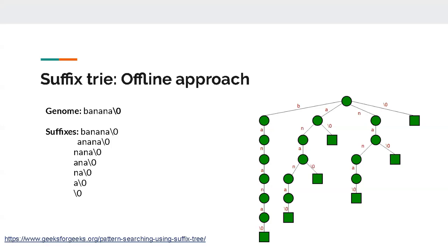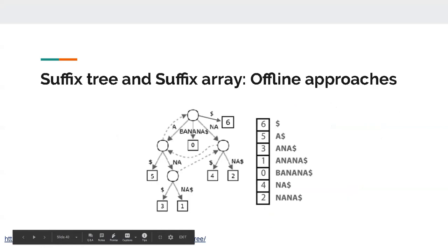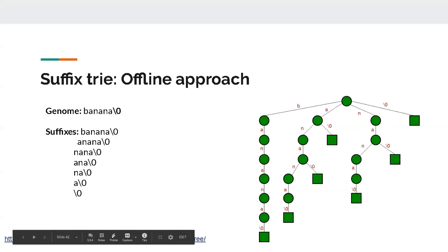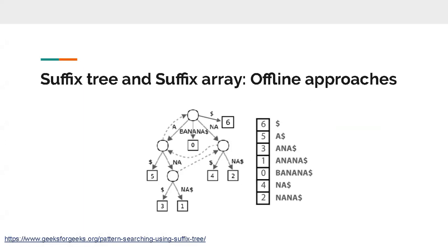Okay. Yeah. So then you can merge these. So let's say now the example of this banana node, which is this path, which is spelling out banana. Because there are no bifurcations in this particular node, we can merge this together and write this as one node as banana over here, right? And you can do the same exercise wherever you are not seeing any bifurcations. So there is no bifurcation at this place, so you can merge this together. So what would happen now is you're merging these suffixes, and this is what we call a suffix tree.